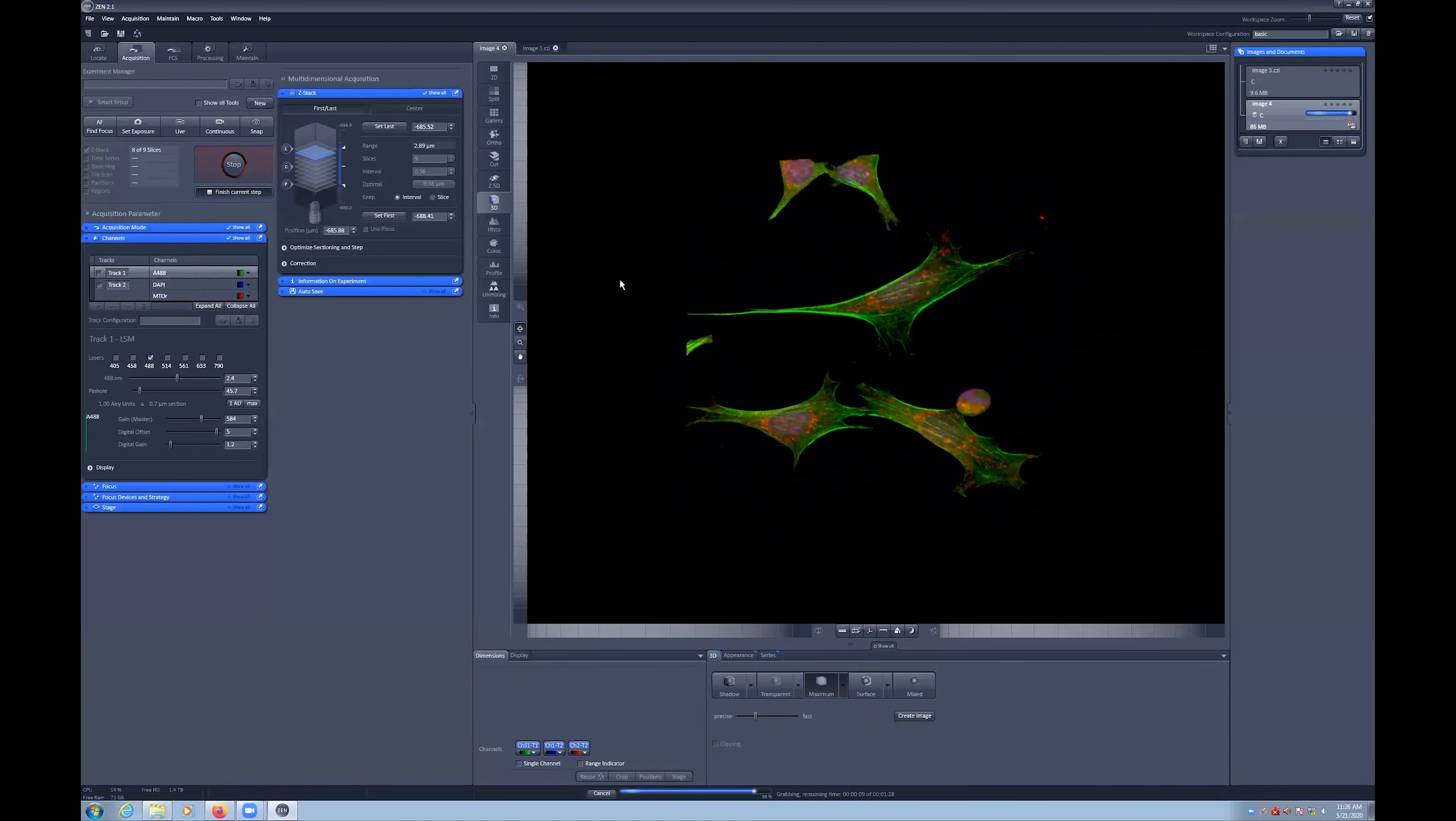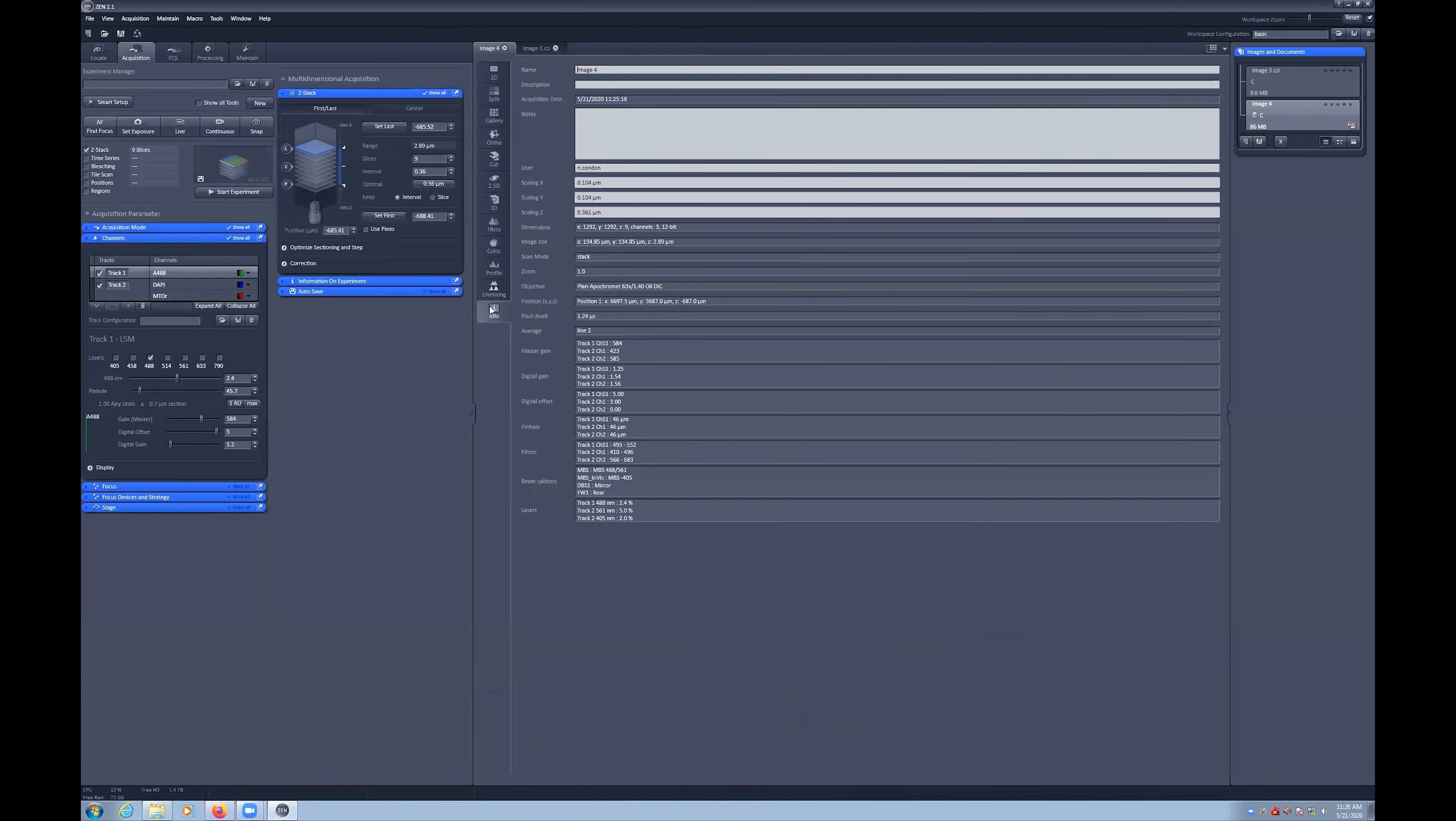The Info tab also has more information now, including the step size and slice spacing details.